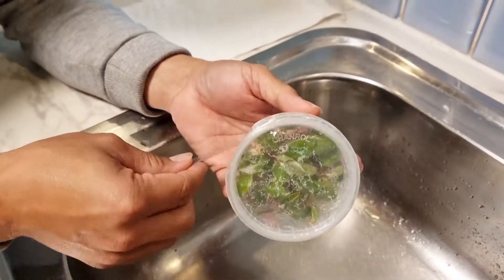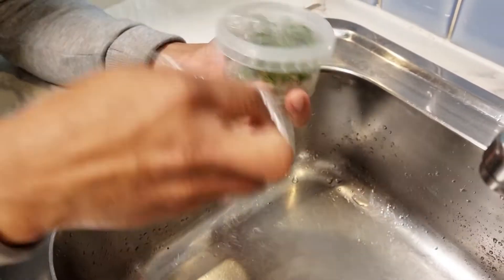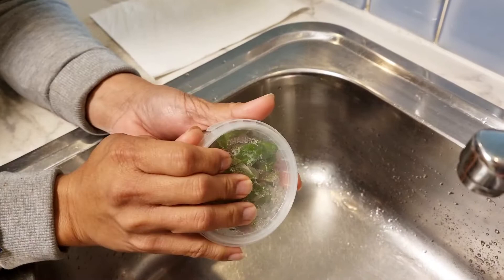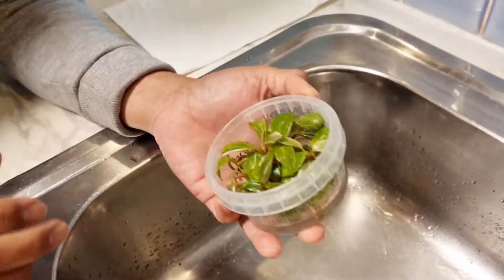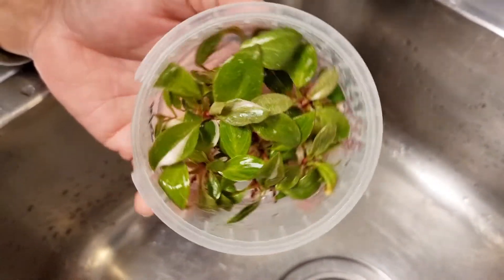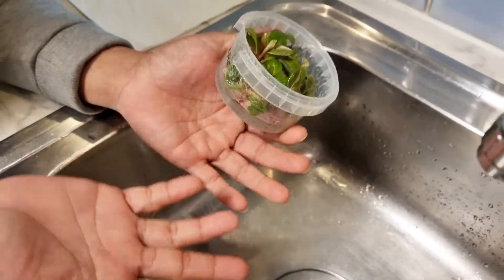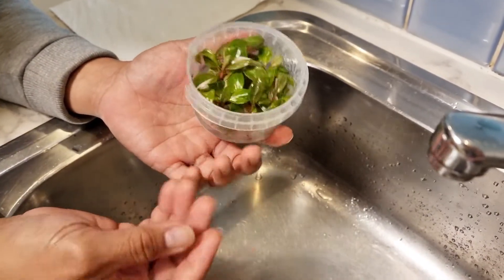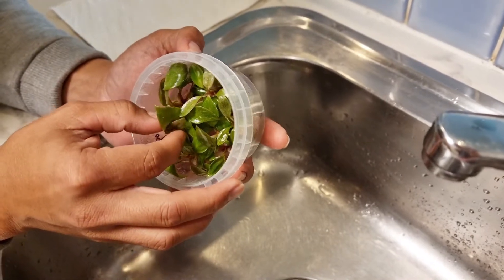So we have the media here. We just unwrap the seal, put the lid on the side, and open it up. So we have the media open. This is the Philodendron Pink Princess. Now we will use our hands — make sure your hands are clean and you've washed with soap and water before handling these plantlets to avoid contamination.